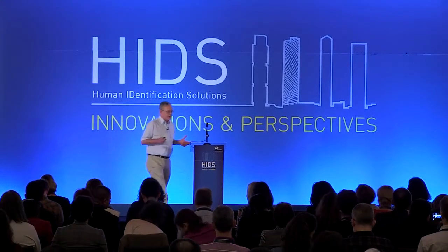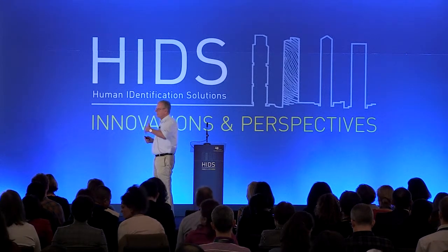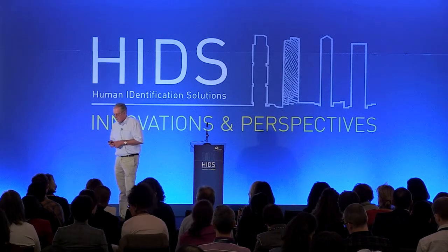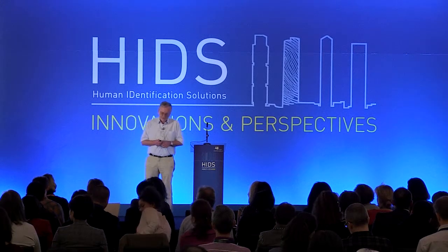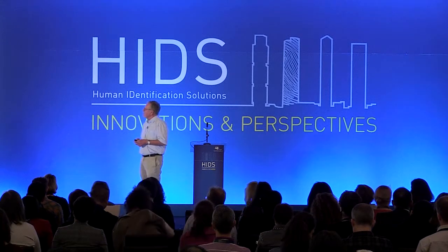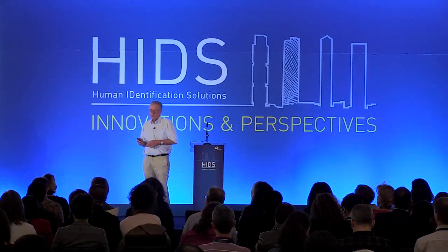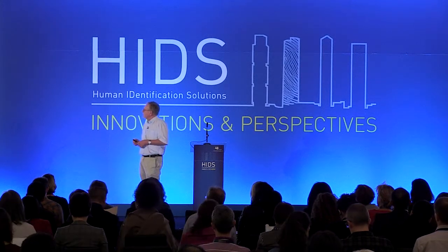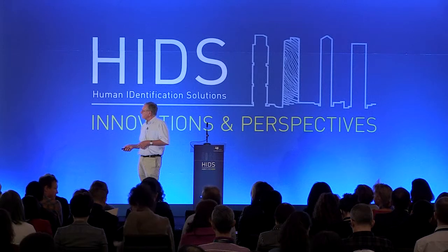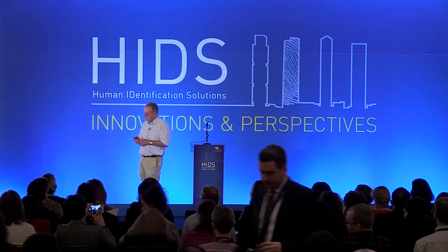I'm going to tell you a little bit about our approach to next generation sequencing. And it's very nice that Bruce has made this nice introduction and Walt has told us about the mitochondrial DNA, because then it's much easier for me. So this method is called second generation sequencing also by some people, and massively parallel sequencing, and that's maybe the best word. And it can be used for a lot of things, and I don't need to go through all these things now.